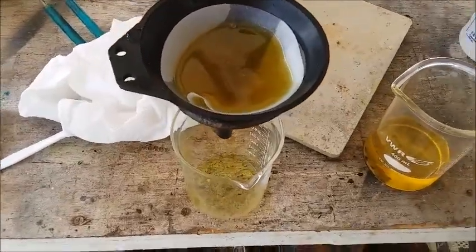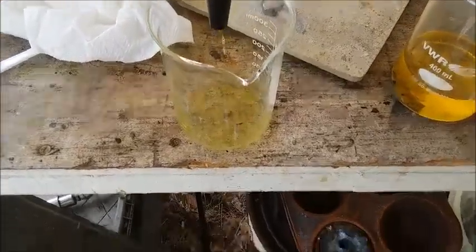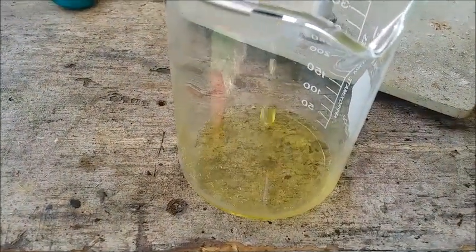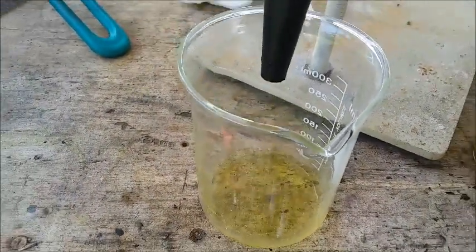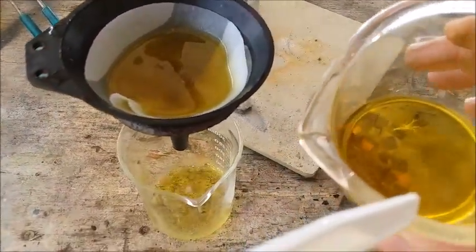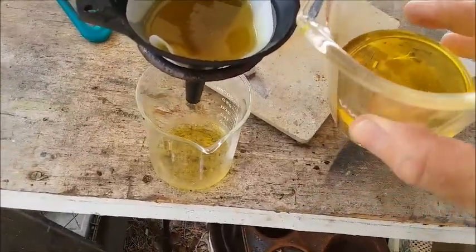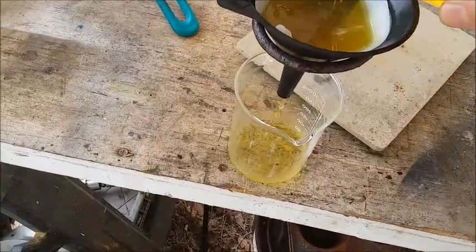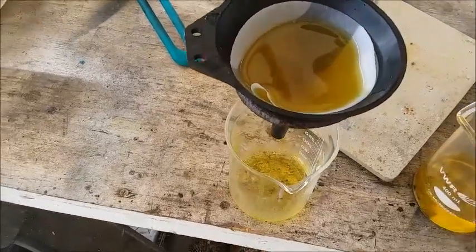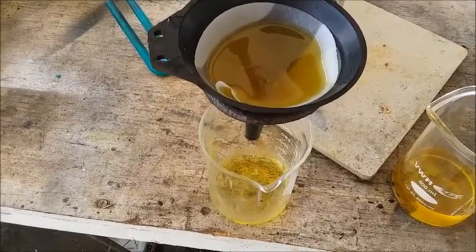This is a professional lab grade filter. It's going to go slow, but it should be good clean liquid coming out the bottom. Leave all of the bits of fiberglass and silicon dyes and everything else, just leave that behind in the filter and get the good clean liquid out. Then we'll be ready to drop the gold. I won't make you watch this, it's going to take a while.